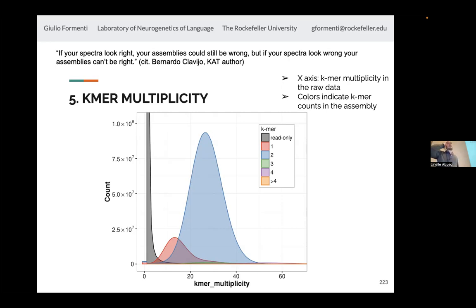Can you explain what it does exactly? What is the different copy? Where is it coming from? The different copy could be, for instance, as I explained before, that because of sequencing errors you get the impression that there is an extra copy of something. So when you build the graph and walk the graph, the algorithm decides that there should be 3 copies and represents an extra copy based on this.